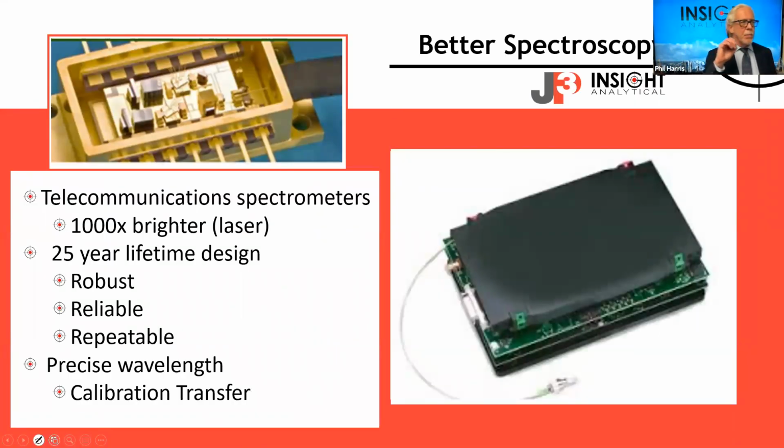One of them is to improve how the spectroscopy gets done. A lot of times when we think about infrared spectroscopy, we think about diode arrays and dispersive devices, or we think about things like Fourier transform devices, FT-NIRs, and all great instruments. Almost all of them have had a certain set of issues when used in the field: either moving parts, difficult to keep perfectly aligned, differences from one instrument to the next, not being able to get precise wavelengths and calibration transfers, or long-term maintenance issues.